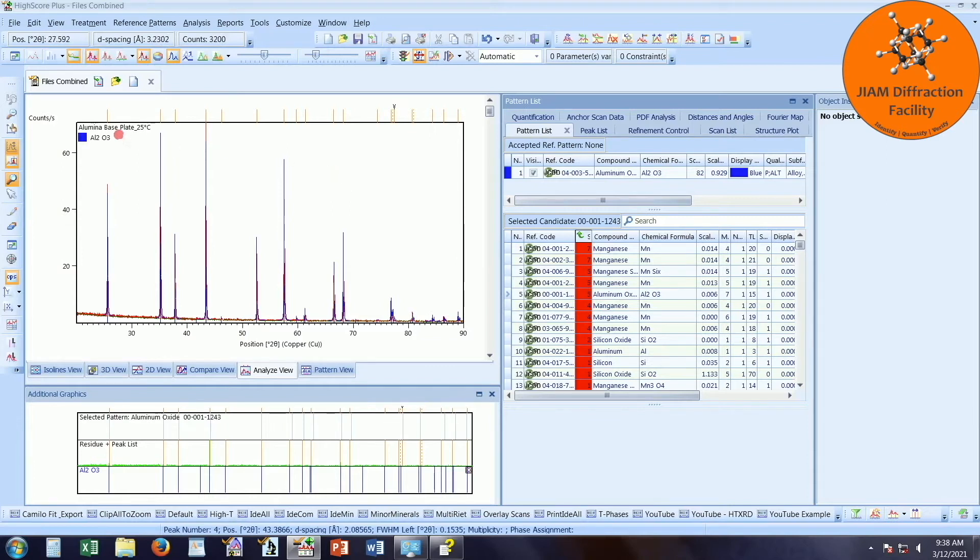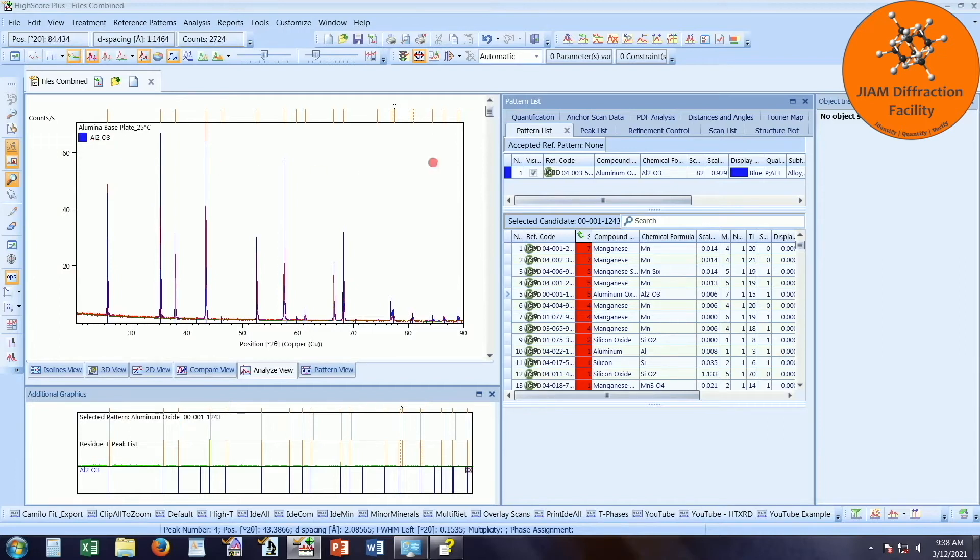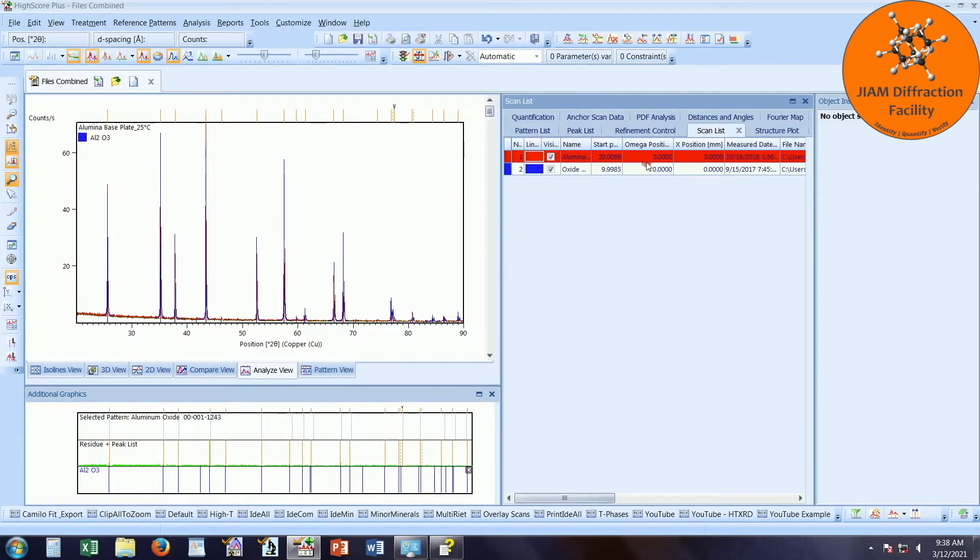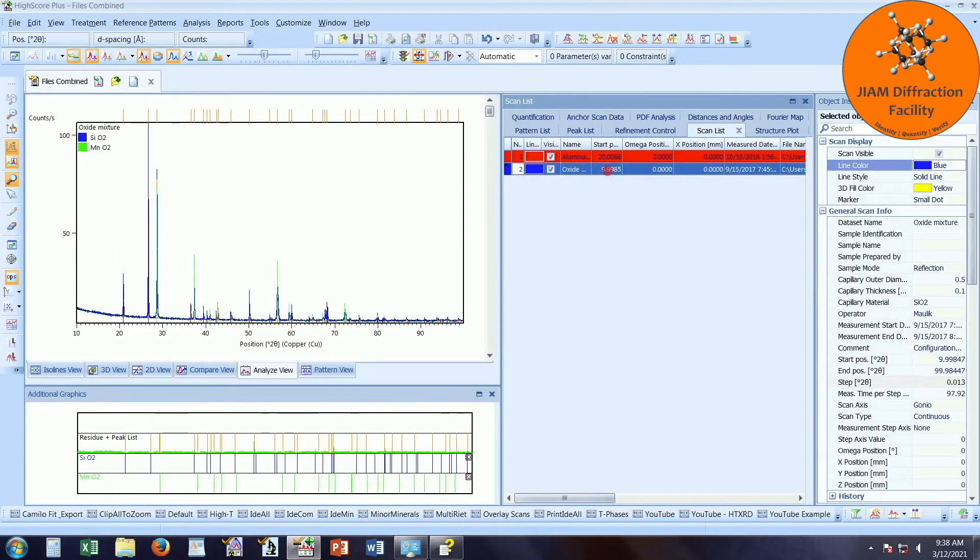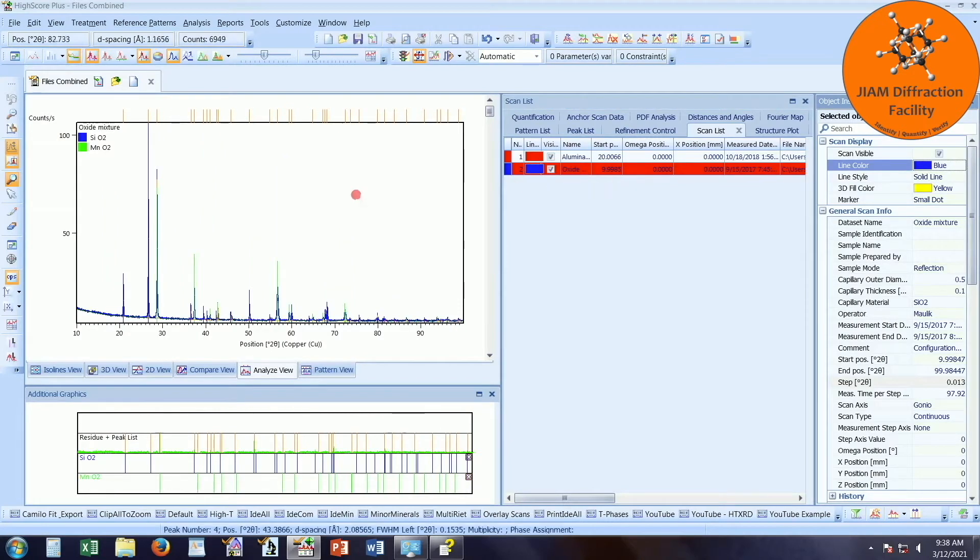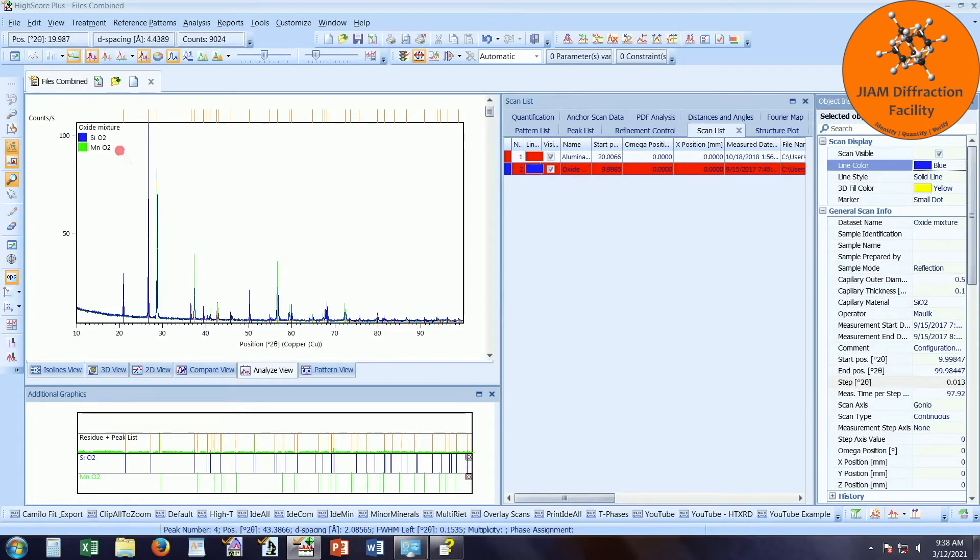For the alumina baseplate, we see that it found alumina, which is what was expected. And if we go to scan list and then left double click the second data set, we see that the oxide mixture it found was silicon oxide and manganese oxide, which is exactly what I know to be the phases for the sample.